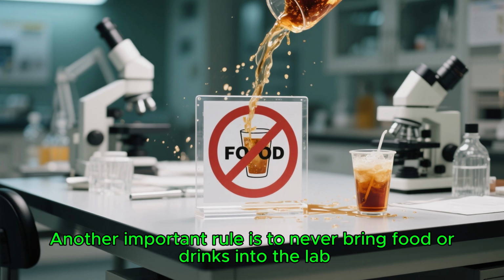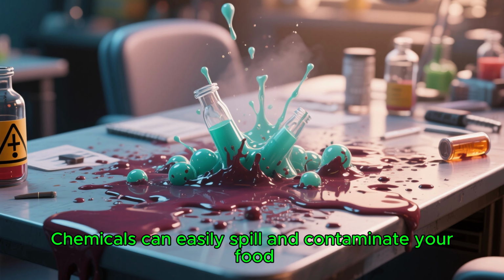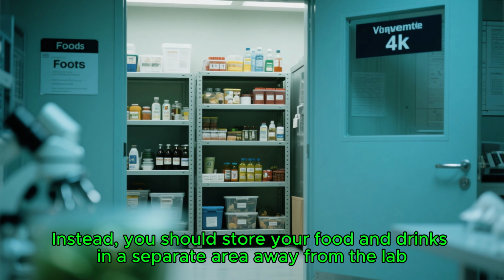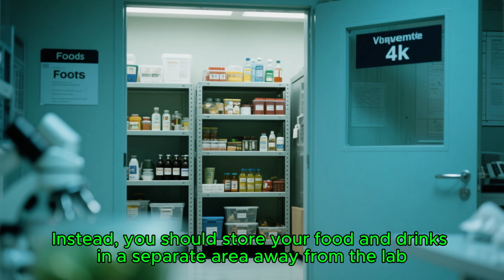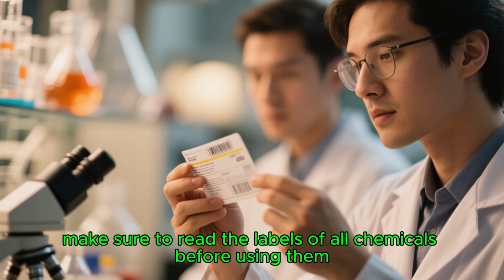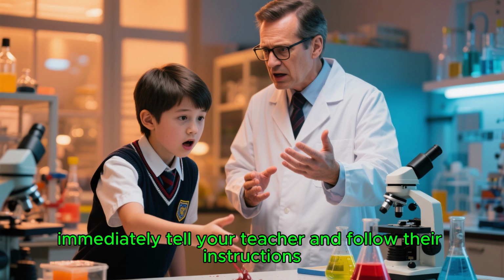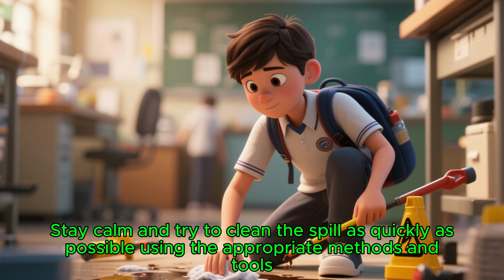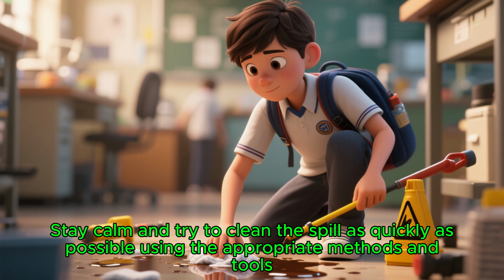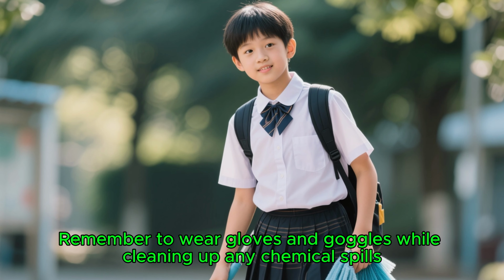Another important rule is to never bring food or drinks into the lab. Chemicals can easily spill and contaminate your food, making it unsafe to eat. Instead, you should store your food and drinks in a separate area away from the lab. Also, make sure to read the labels of all chemicals before using them. If a chemical spills, immediately tell your teacher and follow their instructions. Stay calm and try to clean the spill as quickly as possible using the appropriate methods and tools. Remember to wear gloves and goggles while cleaning up any chemical spills.